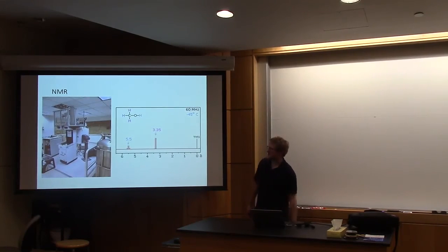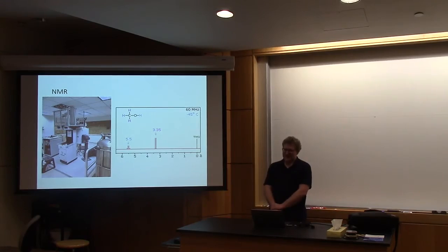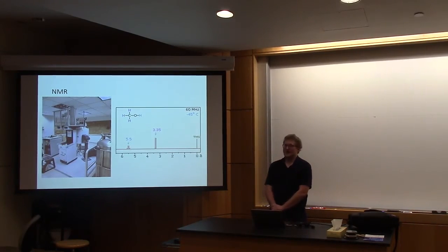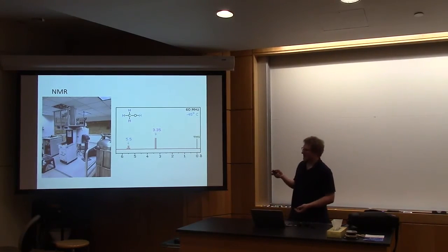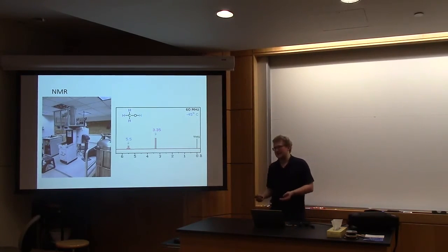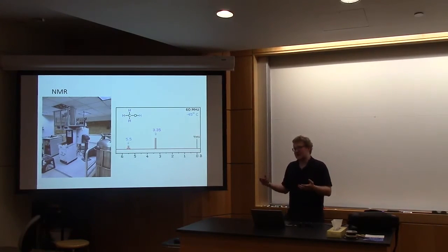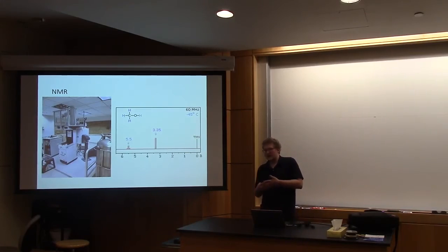So how do we even know that none of them are actually my product? For that, we use our best friend. This is a picture of our NMR downstairs. And this tells me just how many times I failed. The NMR, basically what it does is it allows us to look at molecules directly to figure out how they tick and what they are. To do this, we can select from a short list of atoms to specifically look for, and it will tell us what sort of situation those atoms are in, whether that be by chemical shift or by integration, telling us how many there are, etc.